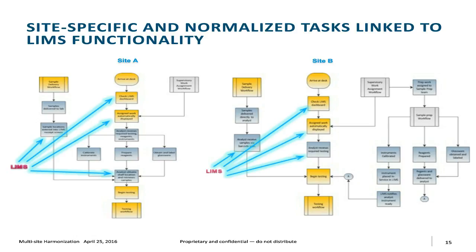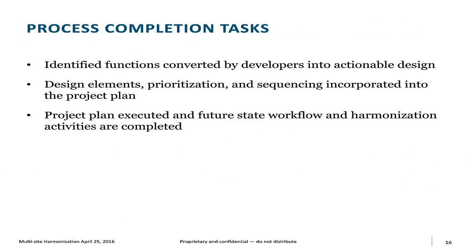You're looking for all of these different abilities to apply LIMS to alleviate certain problems. You're looking for those areas that have nothing to do with software whatsoever for process improvements. And so at the end of the day, when we go across all of those organizations, we're able to prioritize those things that bring the greatest business benefit to a company. And we can then sequence them into the project plan so that those things that should be in phase one are done in phase one. Those things that can be pushed to later phases can be pushed off to those phases and executed when the budget becomes available or whatever for those things.